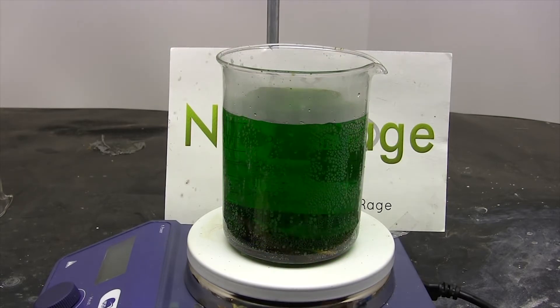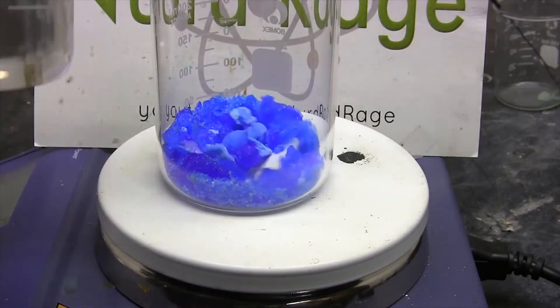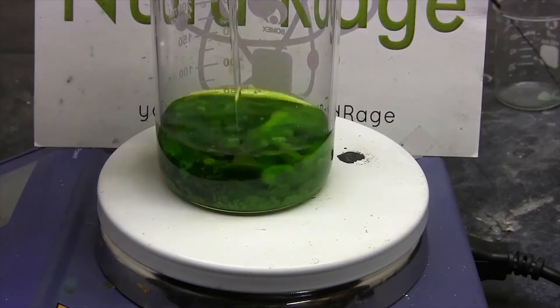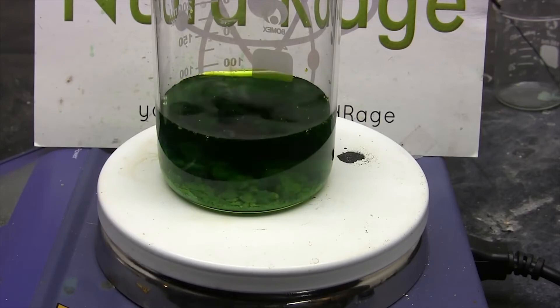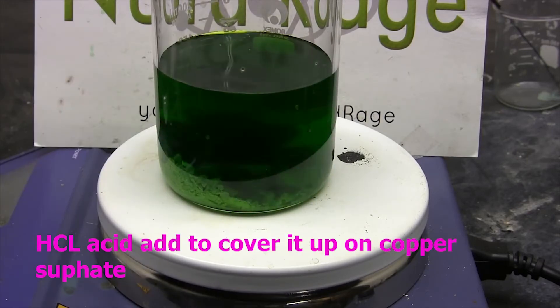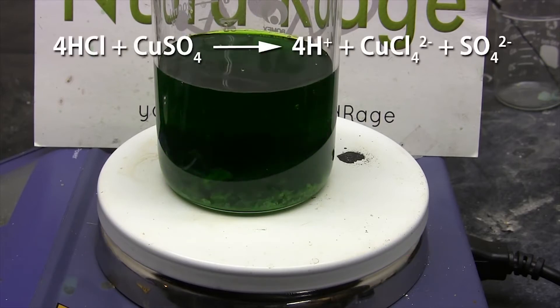The third method uses copper sulfate, but you need to watch out for sulfate contamination. Since we want to produce copper chloride, take copper sulfate and add hydrochloric acid on top of it just to cover it up.